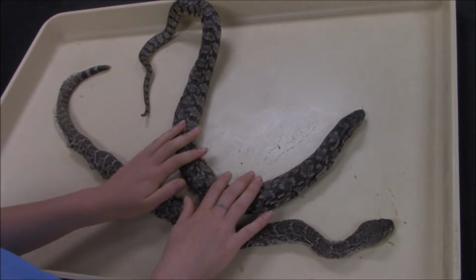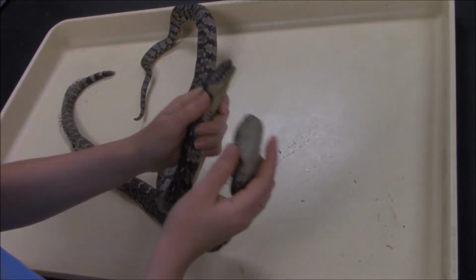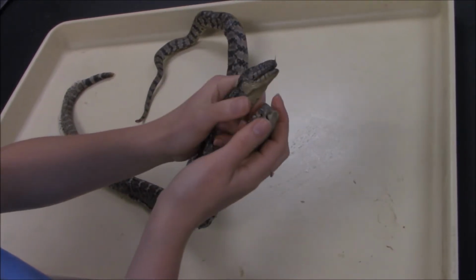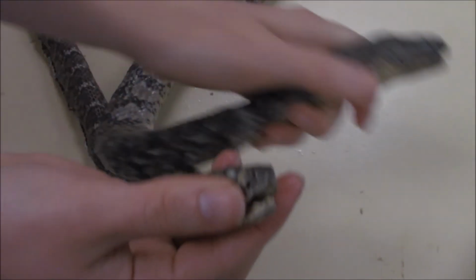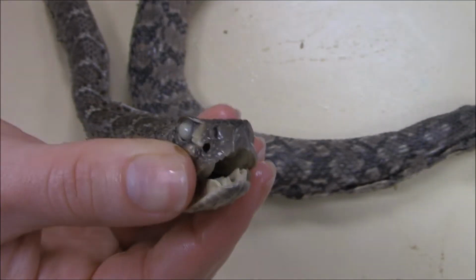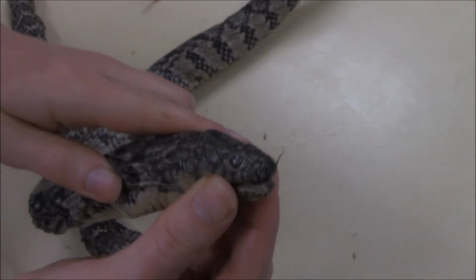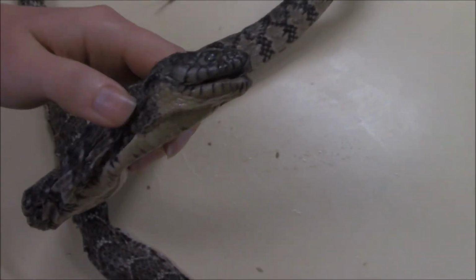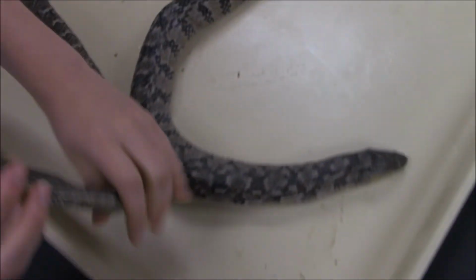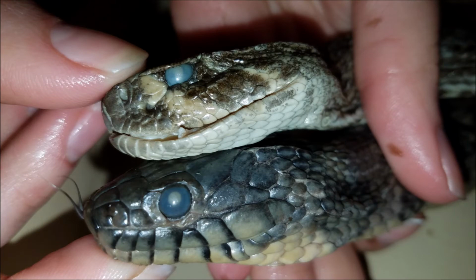So there are several external anatomy differences between colubrids and vipers. One of the first ones is the heat pits, which are located on the face of the viper. These aid in detection of prey during hunting. On our colubrid, we do not have these heat pits. They find their prey via other senses. Another difference between the two snakes is the vipers have a vertical pupil, while the colubrids have a round pupil.